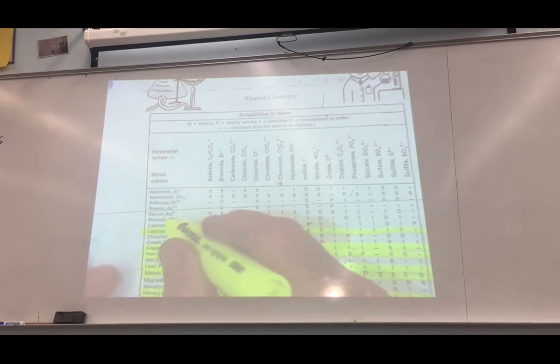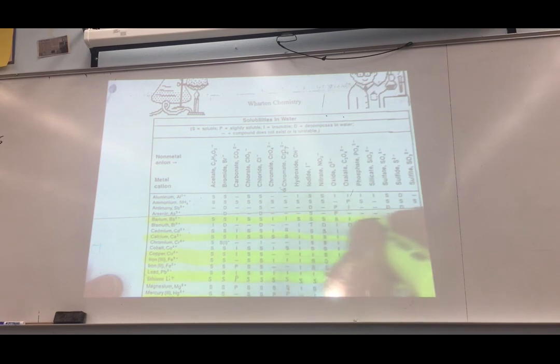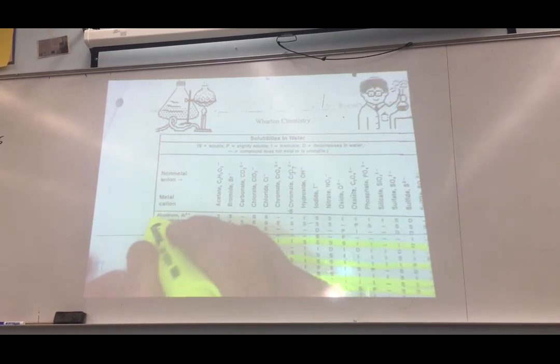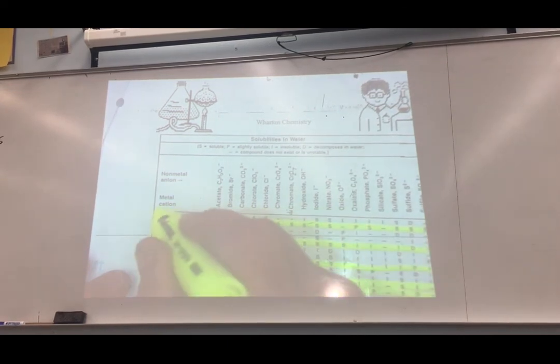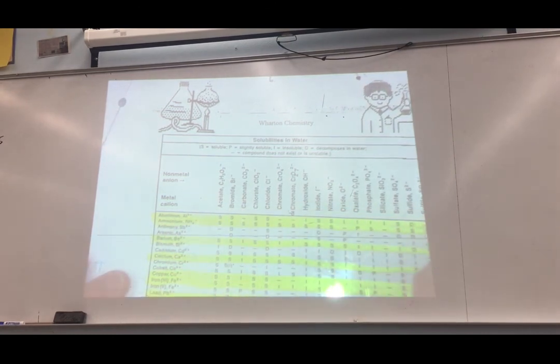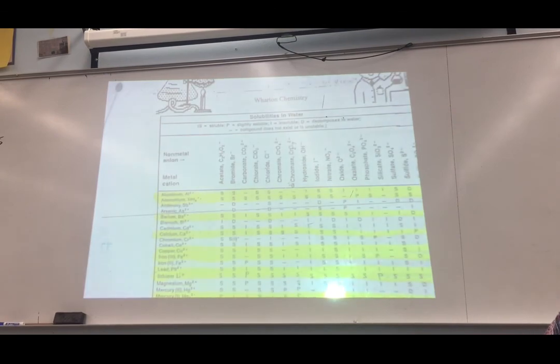No bismuth, no cadmium. Barium. No arsenic, no antimony. Aluminum. And ammonium. That should be the 14 cations.